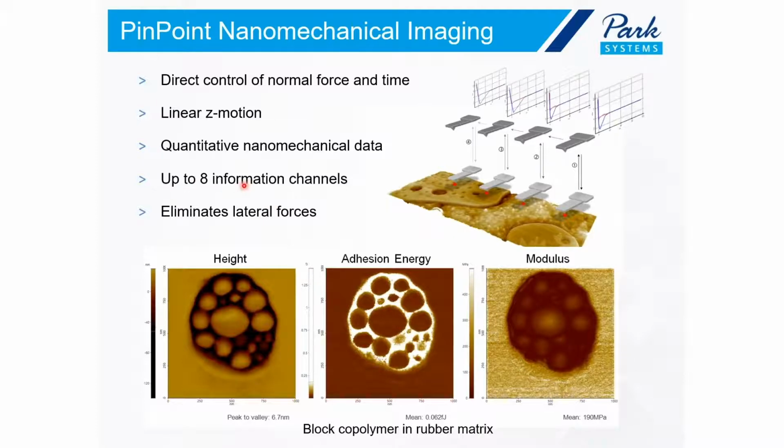You can freely change and choose any channels that you want to record simultaneously with the nanomechanical data and topography. And of course, since the cantilever is moving only in Z direction and only moves in XY when it's disengaged from the surface, it eliminates lateral forces.